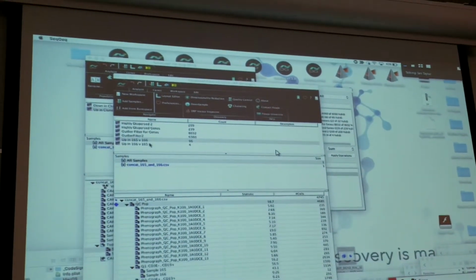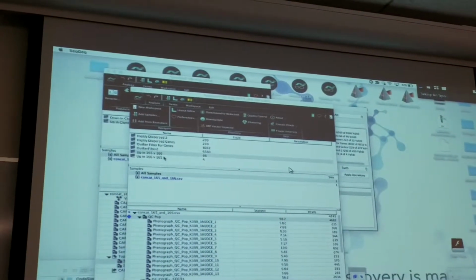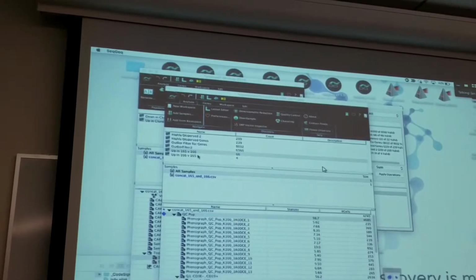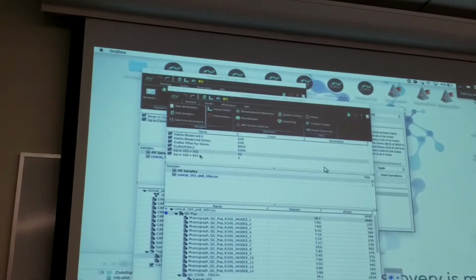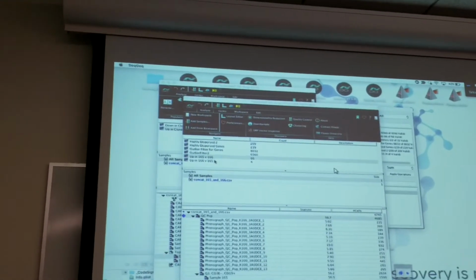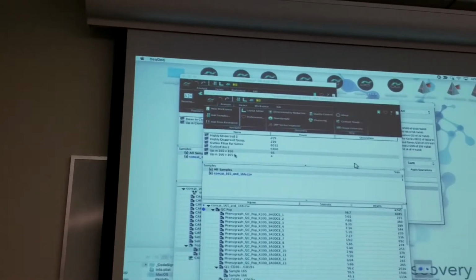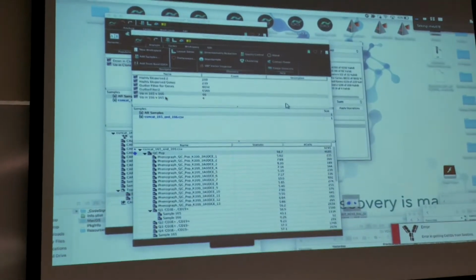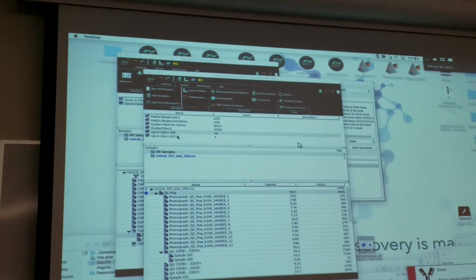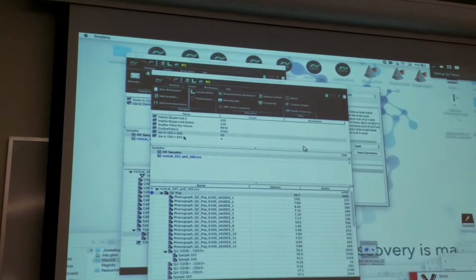We've thought about it in the past, but in terms of trying to match an actual base call to a gene, that's non-trivial. We would need to get access to FASTQ files that are huge. We would probably be searching databases. So it's kind of out of the scope of what we could do. But if we can make it easy for you guys, like currently we can output the cell IDs, but if there's anything else we can do, we'd probably be interested in hearing your thoughts.